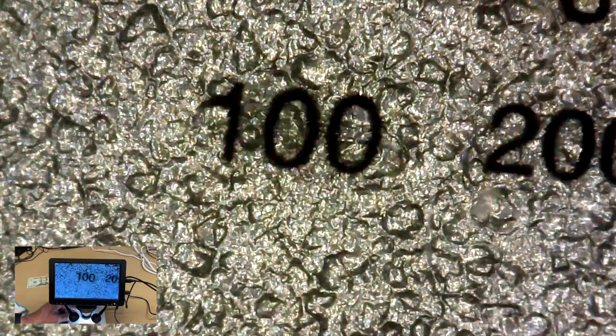This is the little calibration card that came with it. So I'm high up here. I can lower this really low. So here's 100 micron, here's 200 micron, 300 micron.